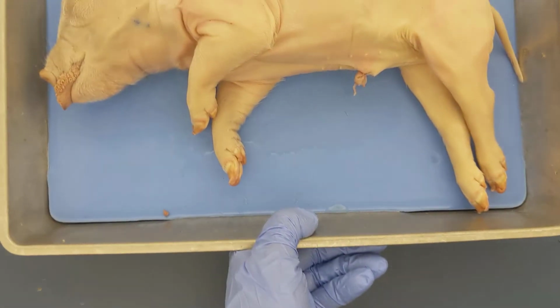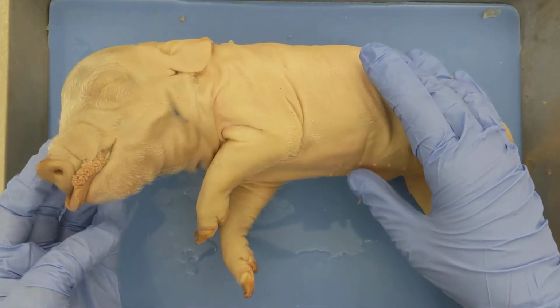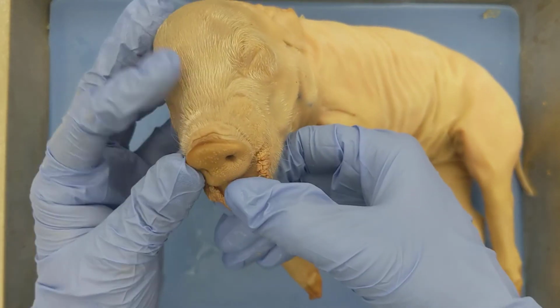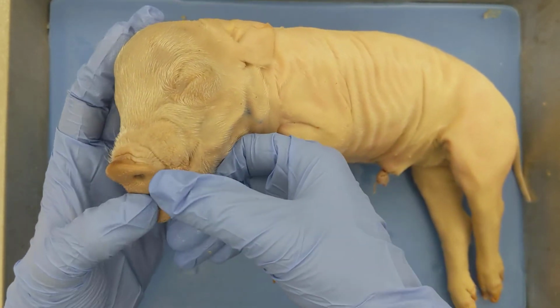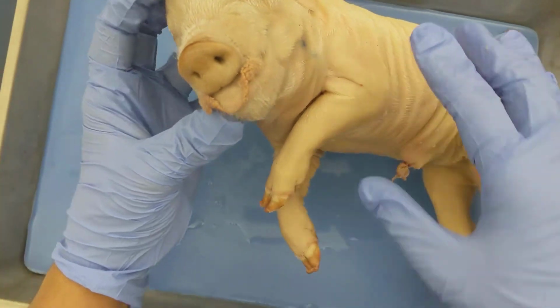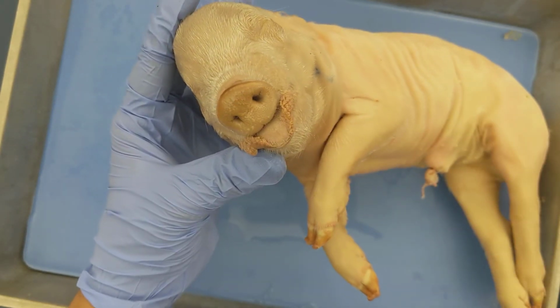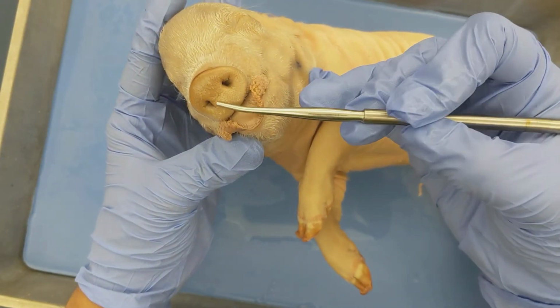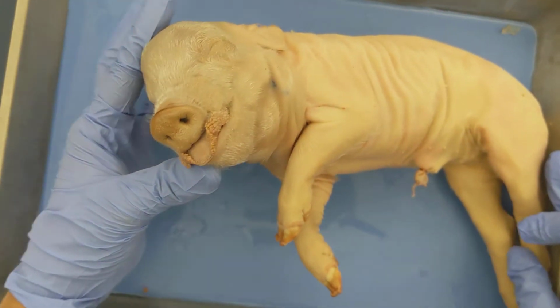Let's talk about some of the external features that are associated with the head, some of our sensory structures. So obviously the pig has a mouth and has a tongue associated with the mouth. That tongue allows the pig to taste, right? The sense of taste. The pig, you'll also notice, has a snout that has two external nostrils, which allow for smell and also to take in air.